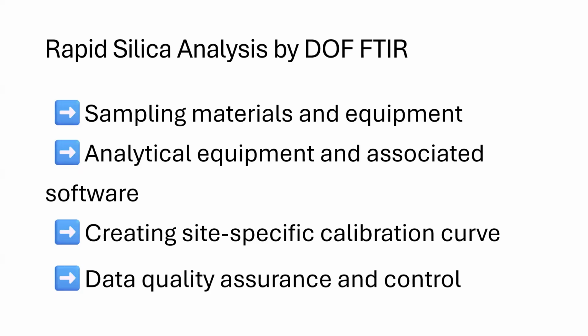I will first introduce the basic sampling materials, and then the presentation goes from there to the sampling procedure using the analytical methods. And then I will deliver some information about creating the calibration curve and then applying this curve to your own samples. Then finally, the quality control for your results.